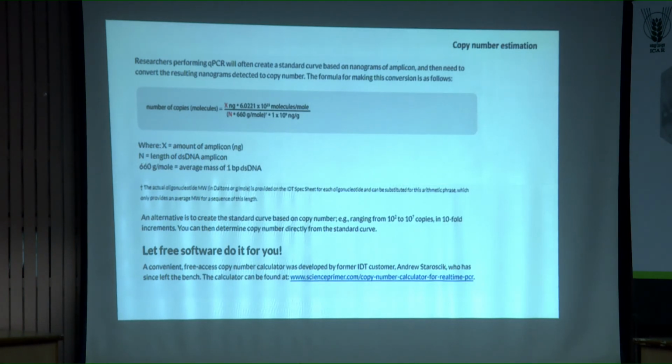Now, for absolute quantitation, we have several online assistants, right? You can note this down. This is one of the finest, very popular also. The formula is given here, showing how to convert the so-called qPCR data into copies, right?